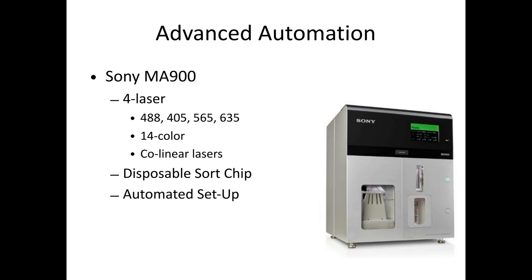I was hoping to make these user accessible machines like other labs have. But the user base at Scripps is just, I don't know if they're just lazy or just so in love with our service that they would rather have us do the work and just drop their samples off. So this machine is really nice, but what made this machine super cool was the finish. And I think it came from the Sony consumer electronics philosophy that everything worked really nice. The automation, the finish, the fit, it was all really cool. The workflow was really cool. It was a well done piece of instrumentation. Now, it didn't have all the traits of the previous instruments, so it just wasn't perfect.